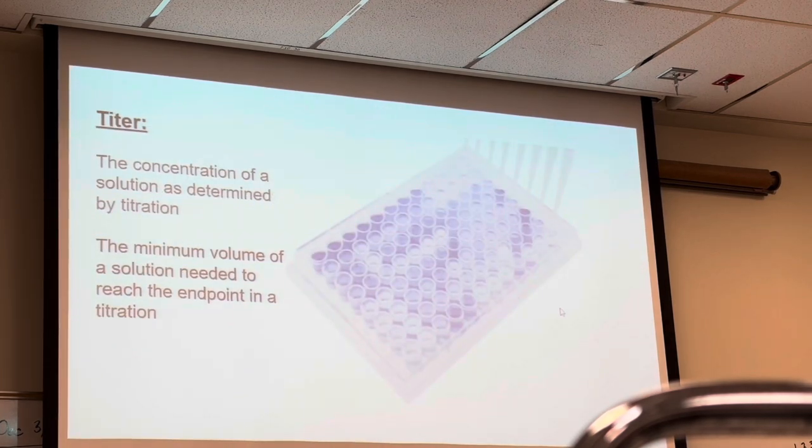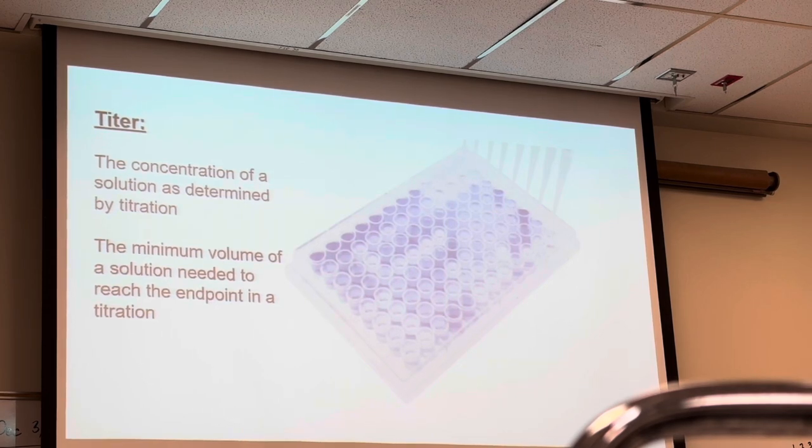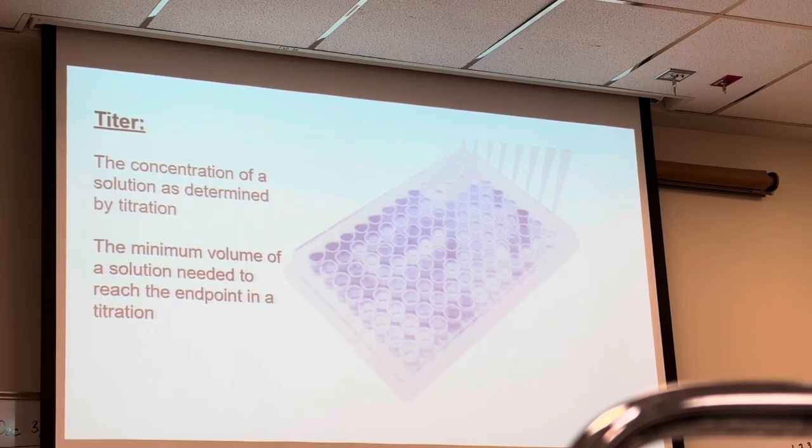So what a titer is, titer means the concentration of a solution determined by titration. So that's kind of a funky way to say it. But basically, I don't want to define it exactly because the definition is used in a looser way. But what titer can mean is the lowest concentration that comes up positive.